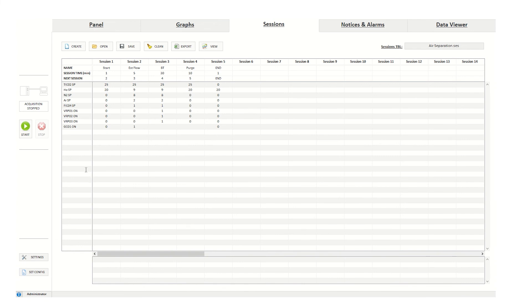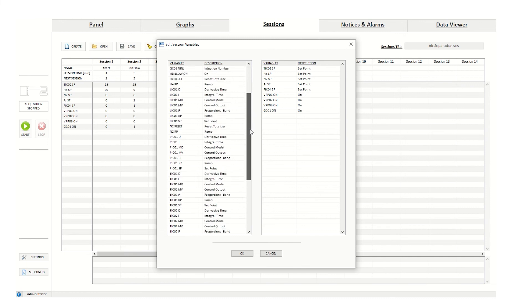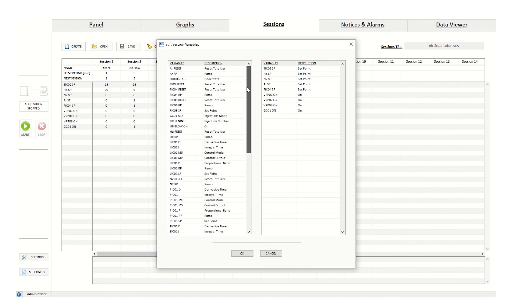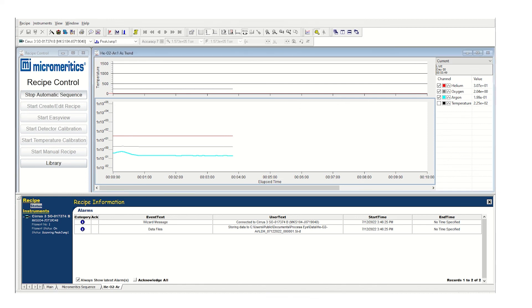In the sessions tab, you can set up experimental methods for your material. You have the option to control all process variables as well as set timings for each analysis step. This allows you to have pre-programmed experiments for sample activation, breakthrough analysis, desorption, and reactivation. In this example, you can see that we are controlling the system temperature, gas flow rates, pressure, blending valve configuration, and on and off signals for the mass spectrometer. Once the necessary session has been loaded or a new session has been created, begin the analysis by pressing the start button. The instrument will then automatically begin collecting data, and when the time is appropriate, the system will send a trigger which will turn on the mass spectrometer to begin collecting data.